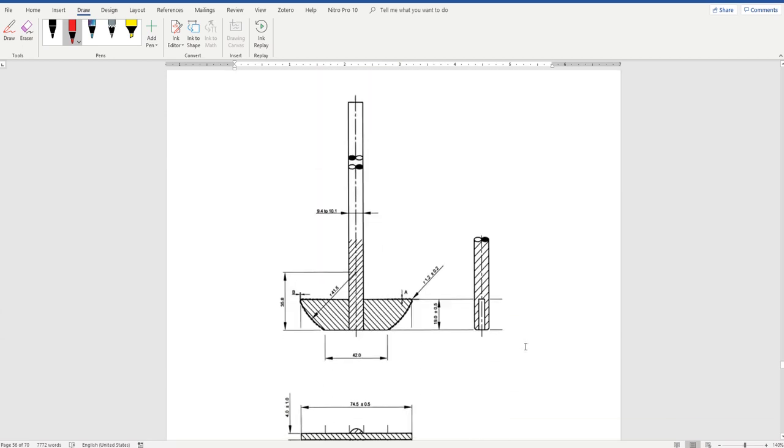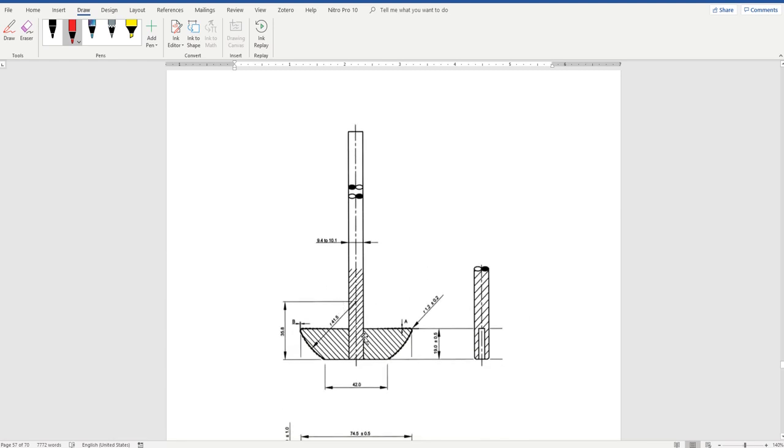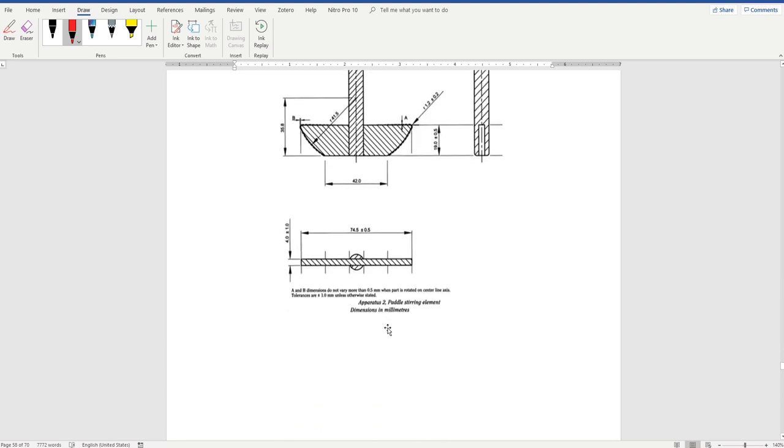Okay, the other apparatus, which is the paddle apparatus, which is apparatus 2, instead of basket at the bottom of the shaft, there will be a paddle. Paddle means a fin, like a butterfly, like a fan, okay, in order to stir the medium.